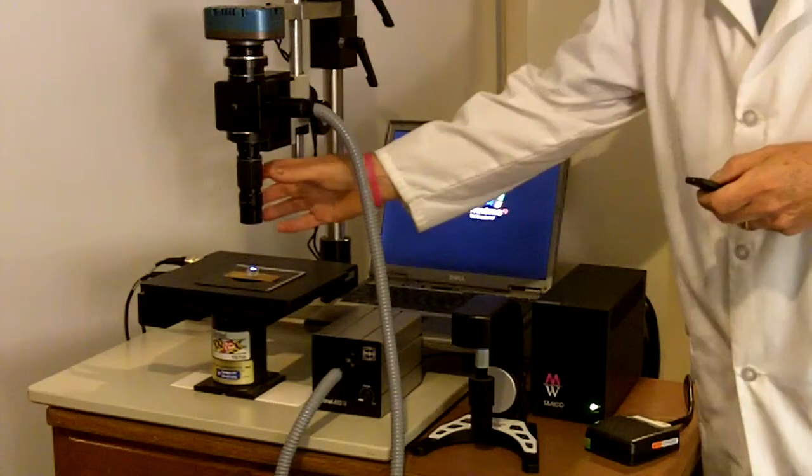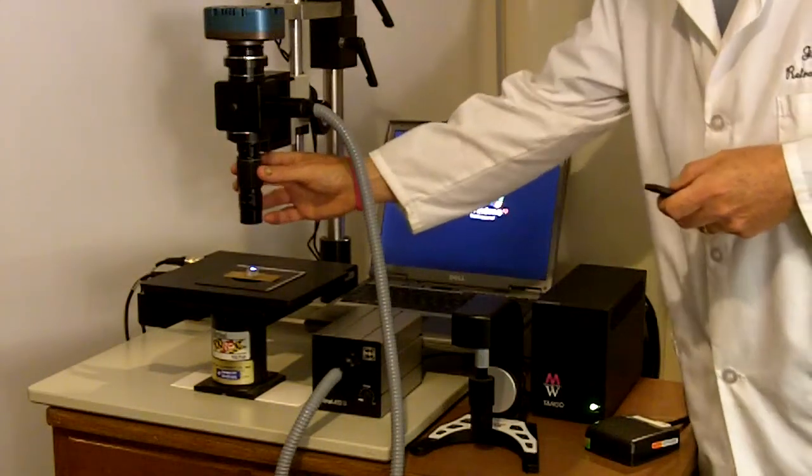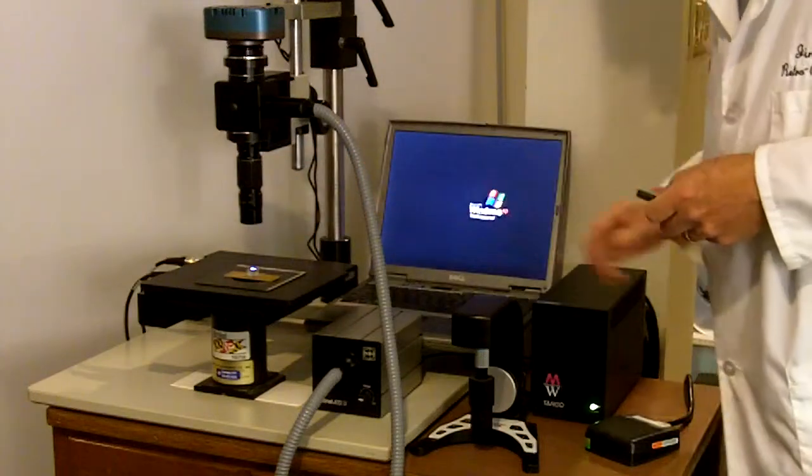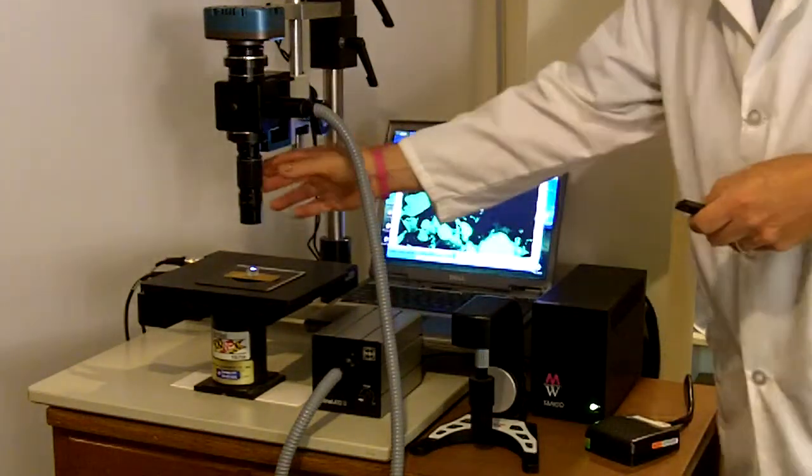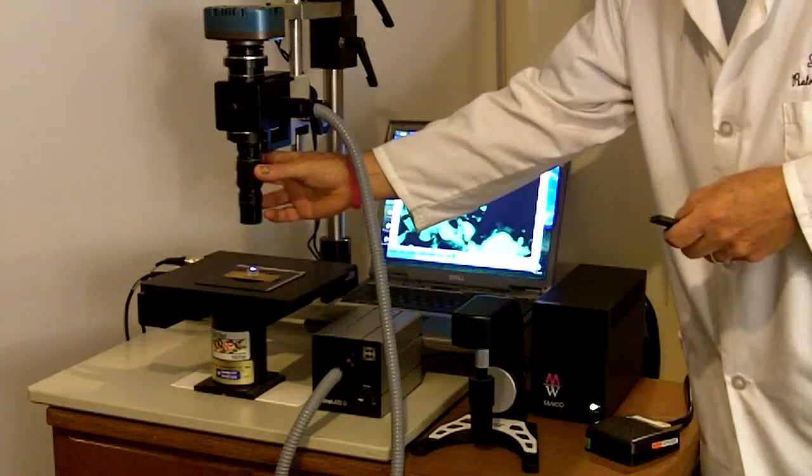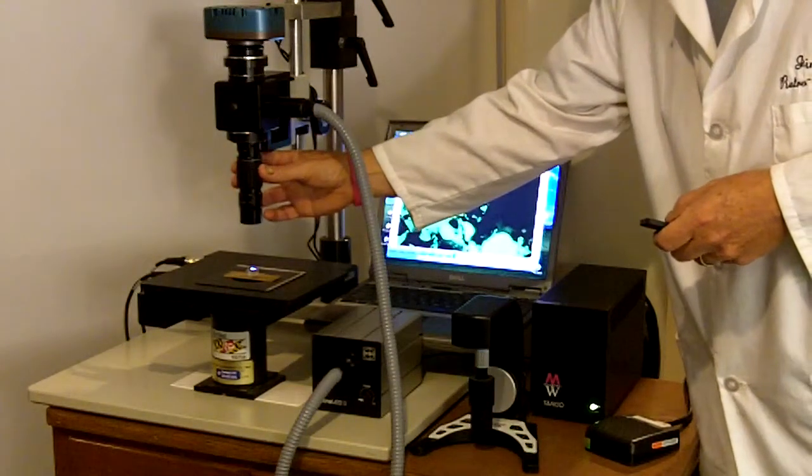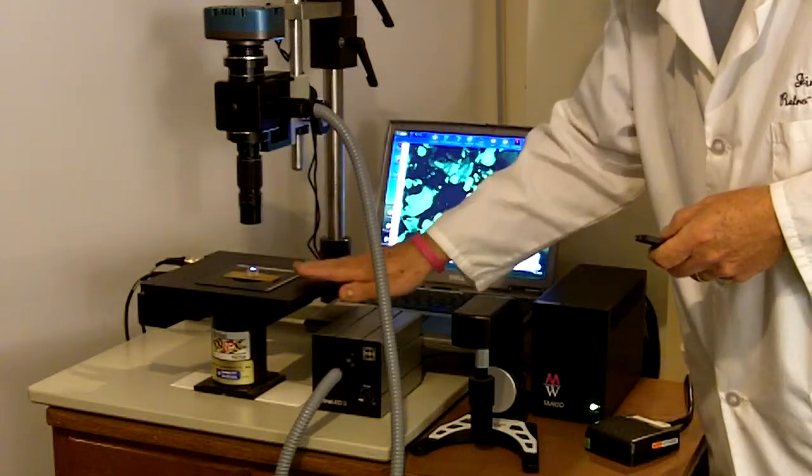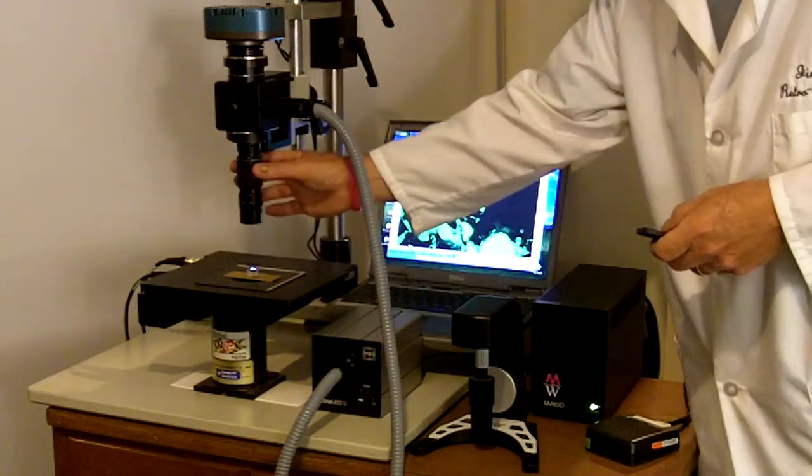The beauty of the system, though, I think is the internal focusing that we get with the Retrofloor main microscope. This module has internal focusing so we're not moving the sample and we're not moving the microscope.